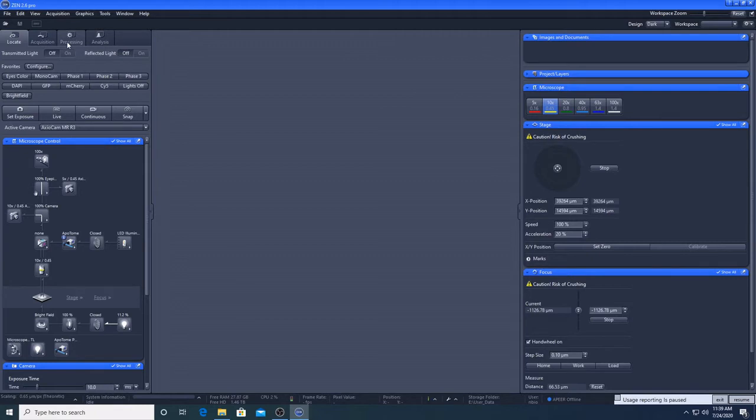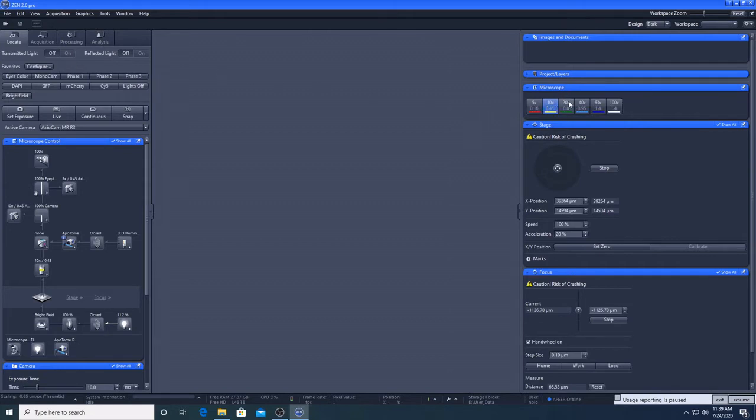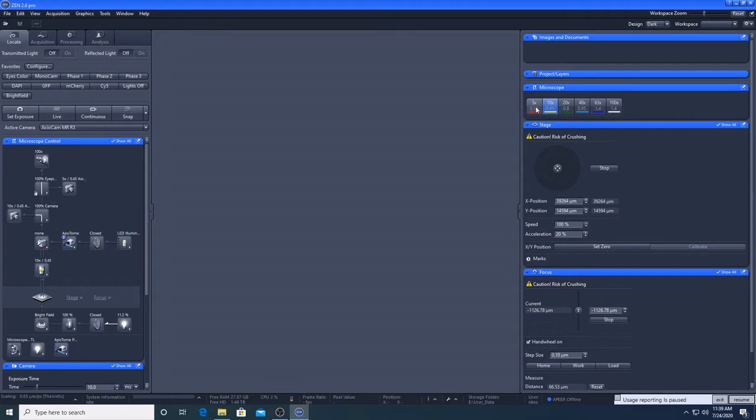I will also briefly introduce the Processing tab. Over on the right hand side, we have some buttons that we can use to change the lens. If you wave the mouse over each one, you can see more information about that particular lens, including the magnification, numerical aperture, working distance, the mountain media, etc.